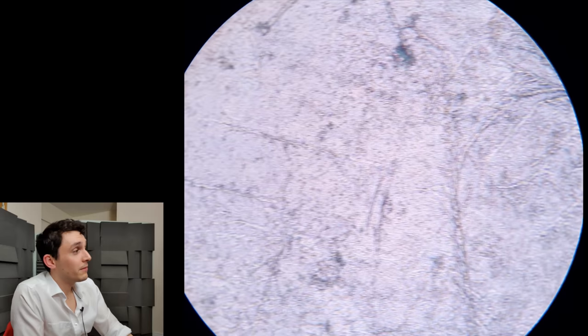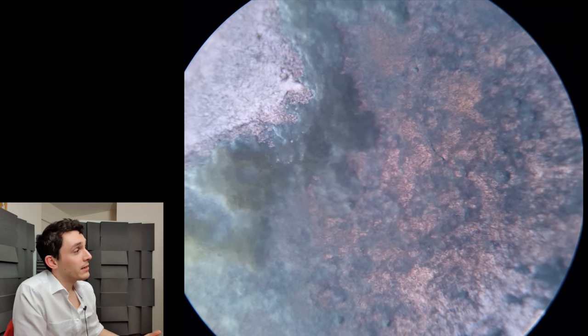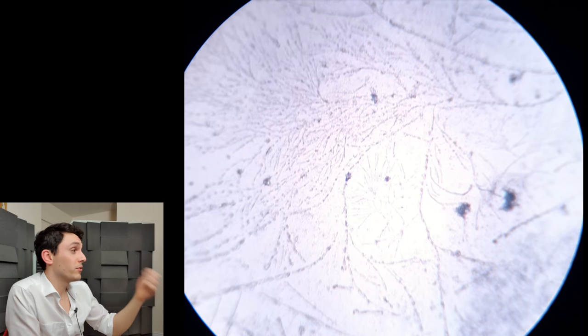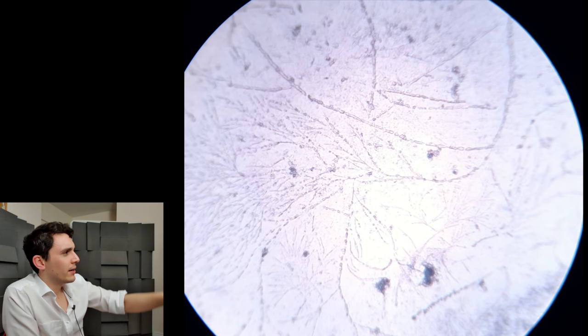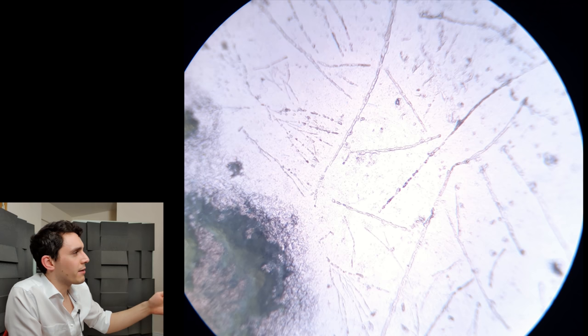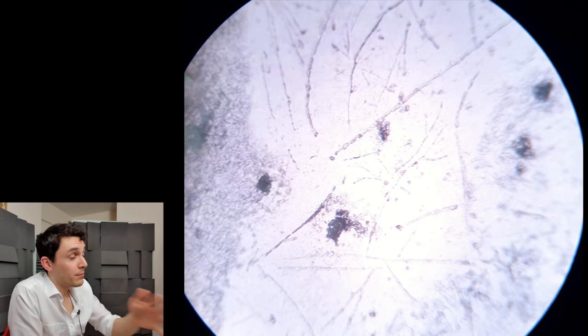Again, this is a very nice shot. Just look at that hyphae branching out like a tree. We would have never been able to see this had we not applied the chemical. So this is a very easy test to do, really. Again, the thick greeny-blue stuff is where I've just not put any effort in and it's just caked onto the slide. But look at the network — it's just absolutely extraordinary, the vastness of this hyphae. Moving across a slightly thicker area of the slide, and once we're past the thick part, the hyphae shows up again.